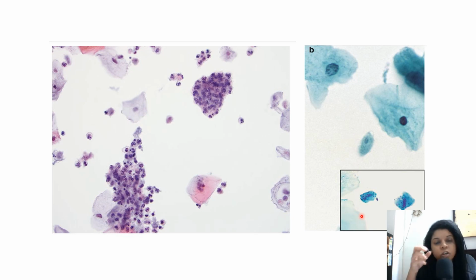For me also, trichomonas at times is difficult. So in this slide, see, this is trichomonas, this is trichomonas, this is trichomonas. At times it is a little bit difficult to find trichomonas. I frankly admit that my PGs are sometimes better at finding trichomonas than myself.